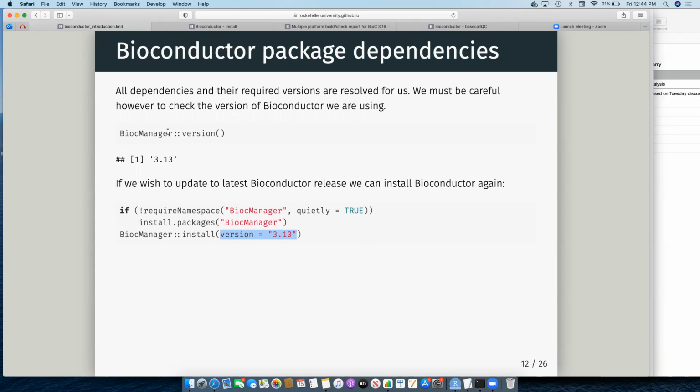Otherwise you might find yourself in a situation where a package is updated, some of the information in it has now changed, and your result is oh so subtly different. That will upset you, and it will be a pain. You lose one gene, you have to remake a figure or something. Once you've started installing packages, stay in the version you are. If you want a new set, install a new R, and I can help you set that up if you're on Mac. Windows is very straightforward.